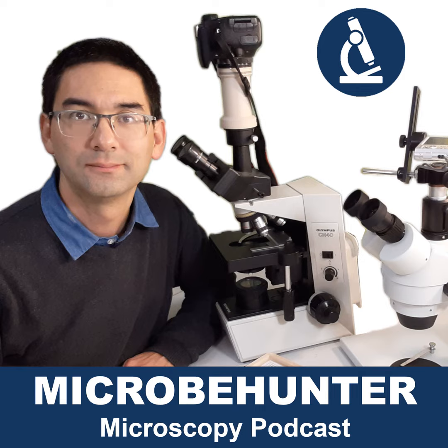First of all, short answer, if you want to connect your microscope to a laptop computer or a desktop computer, this is relatively easily possible. What you need is a dedicated microscope camera which connects to the computer over USB. This is very, very common, especially also in research. Many people will use a computer screen or a laptop, of course, to do microscopy.